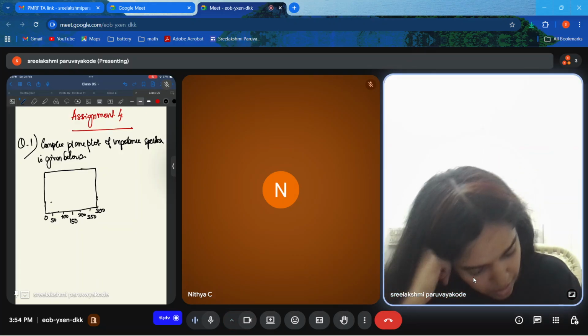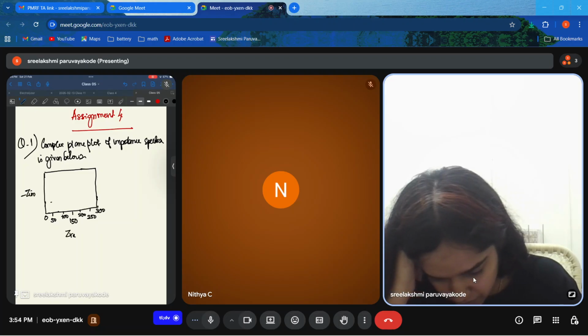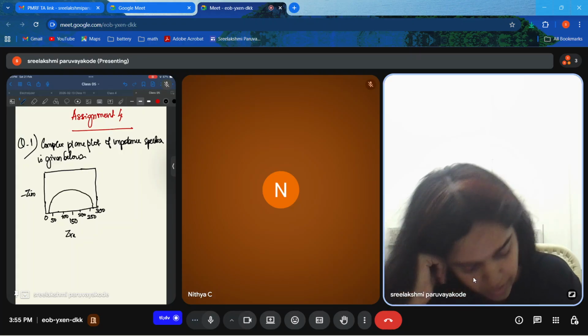So this is the plot. Now the circuit starts somewhere here and it ends somewhere between 250 and 300.